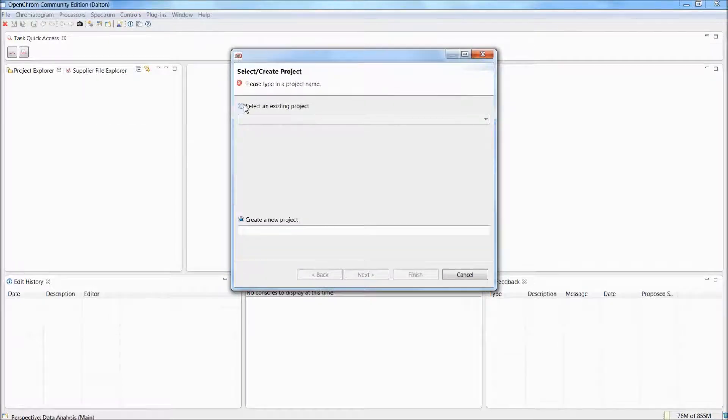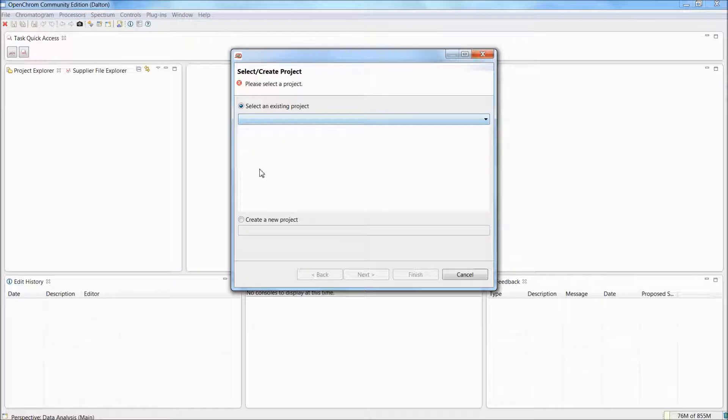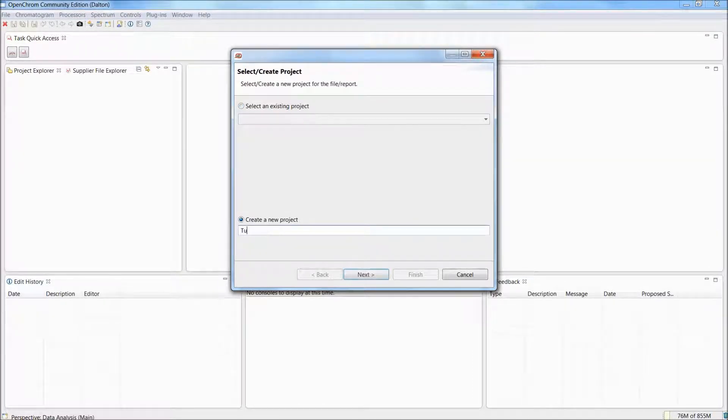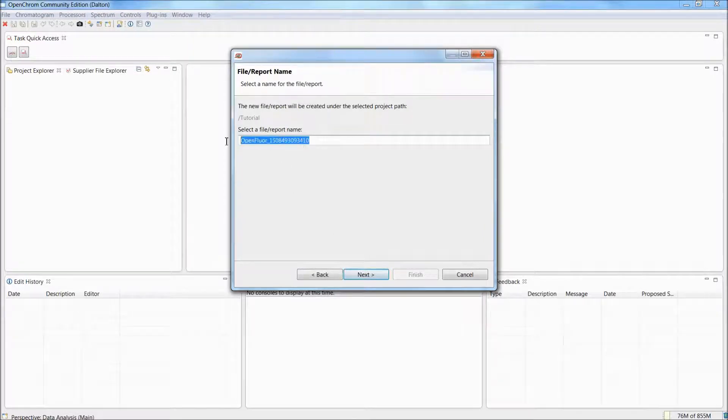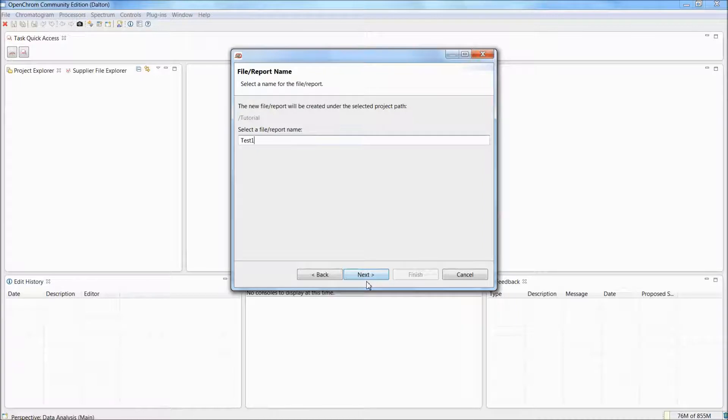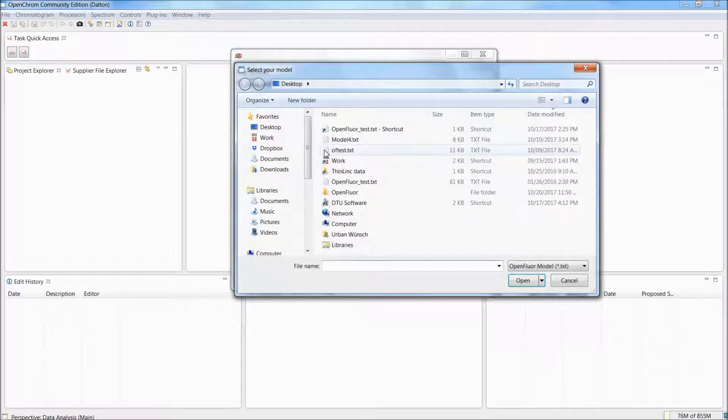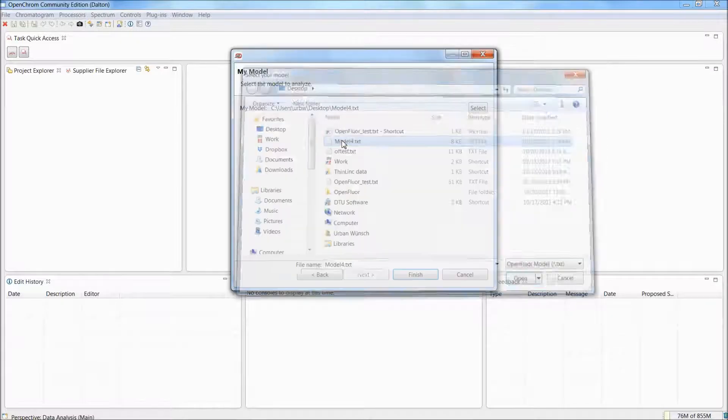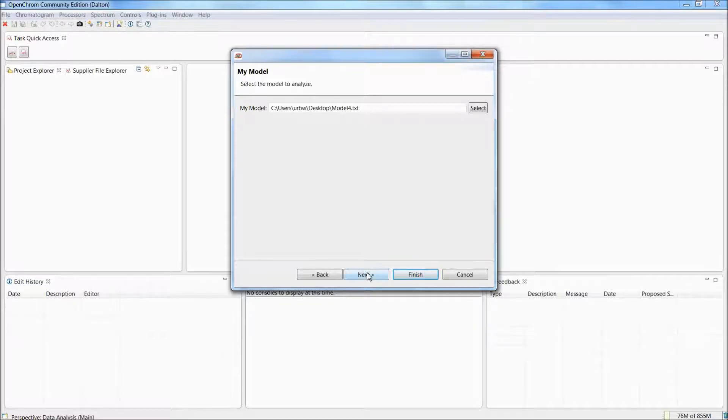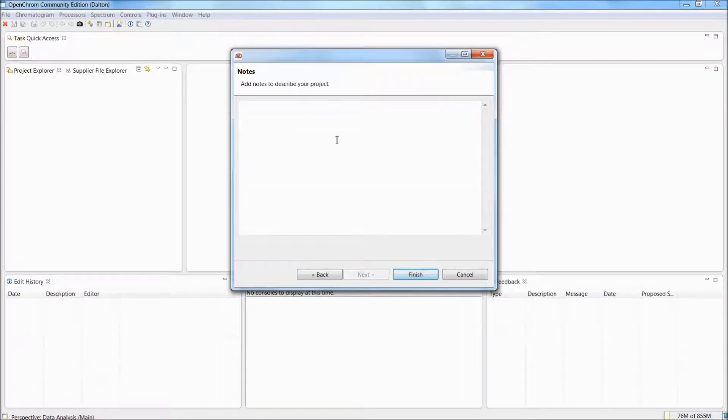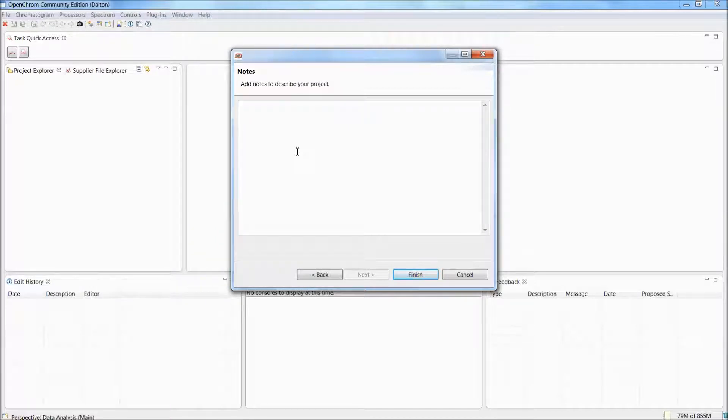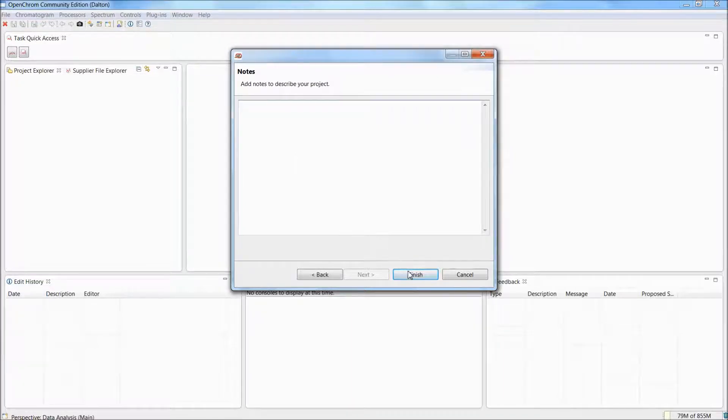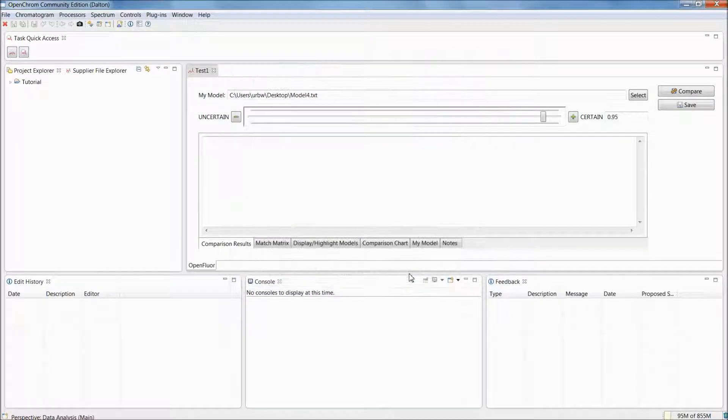A wizard opens that will either allow us to select an existing project, which we don't have yet, or create a new project. We'll create a new project, called tutorial, select next, create a report file called test1, click next, and select the model. In this case, I selected a four component model that I simply exported using the drEEM toolbox and the OpenFluor function within that toolbox. Click next, and you see a notes page. This page will allow you to add notes that you can then later on access again, so if you come back in a month, you know exactly what you did back a month ago. But for now, we haven't done anything, so no need really to add any notes here. Click finish, and the OpenFluor interface opens.